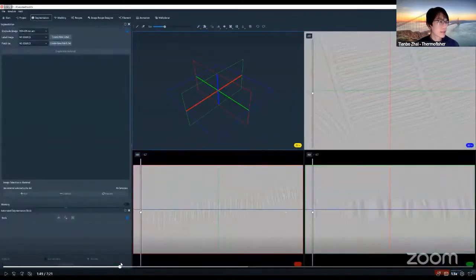The actual prediction part, the actual deep learning training part, happens in a separate tab than what you have just seen. There's a dedicated tab called segmentation. We will perform such analysis there. And as you see from different cut views, this is again a typical CryoEM data set. The most noticeable structures lie on the XY view.